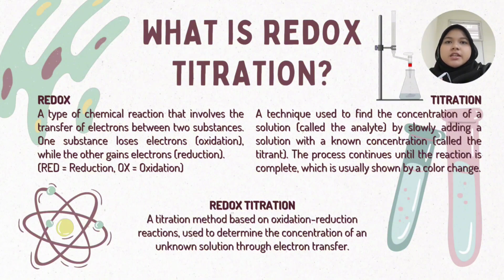Titration means a technique used to find the concentration of a solution, we call it the analyte, by slowly adding a solution with a known concentration, we call it the titrant. This process continues until the reaction is complete, which is usually shown by a color change. Combining these two words, we get the meaning of redox titration, which means a method based on oxidation-reduction reactions used to determine the concentration of an unknown solution through electron transfer.